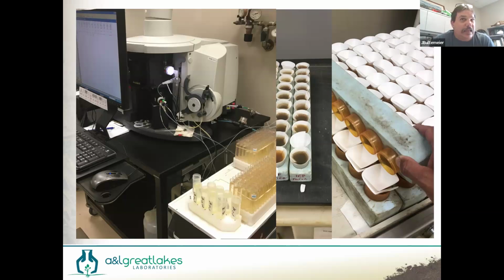And that's where we're seeing lab changes. When folks ask me, well, what's the new thing in lab? Where's lab technology moving? It's like a lot of the industry around us. How can we get to the same result in fewer steps with less inputs? And so that's how we are able to run 15, 16,000 soil samples a day, because of automation and these flow-through processes.